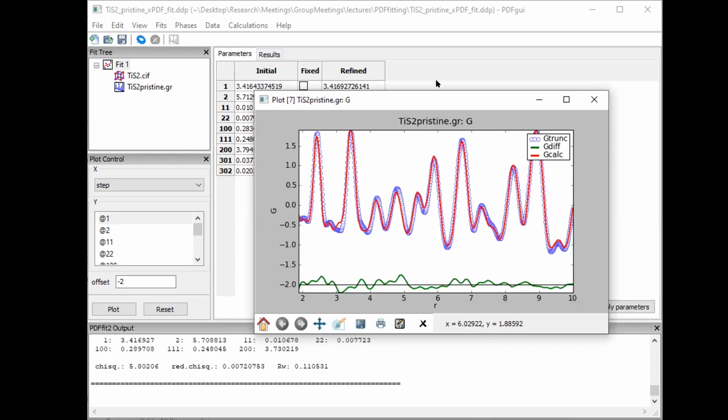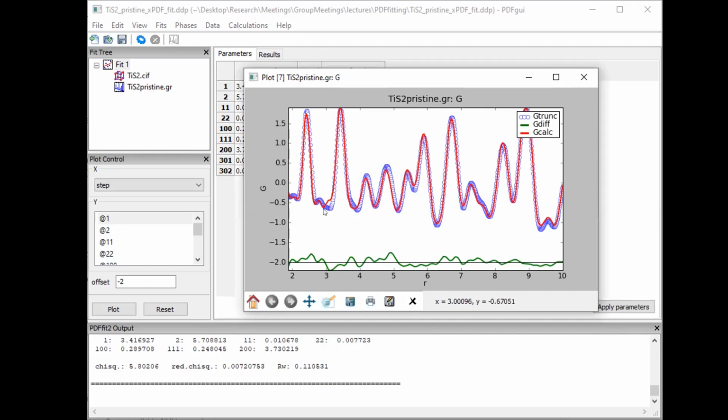Okay, so in fact, it can be generally nicely fitted using the average structure, right? The value increased a little bit, but I would say it's quite reasonable if we consider the other statistics. So this is a reasonable number, saying that the average structure is adequate to describe this kind of local structure, because it can fit the local pattern quite well, right?